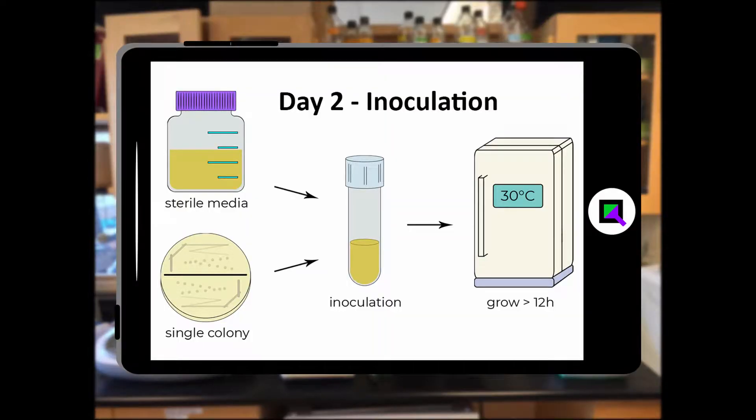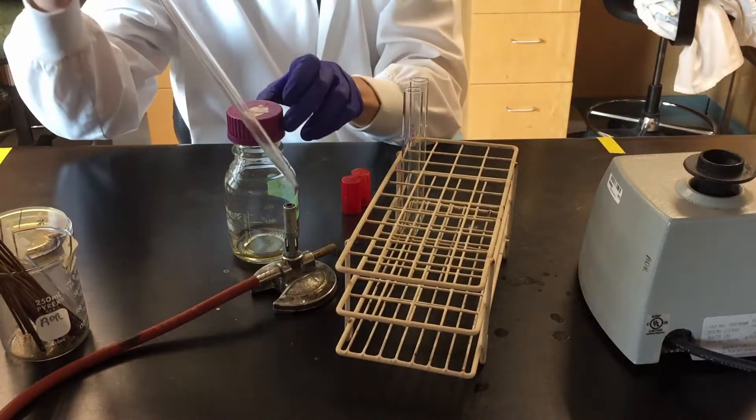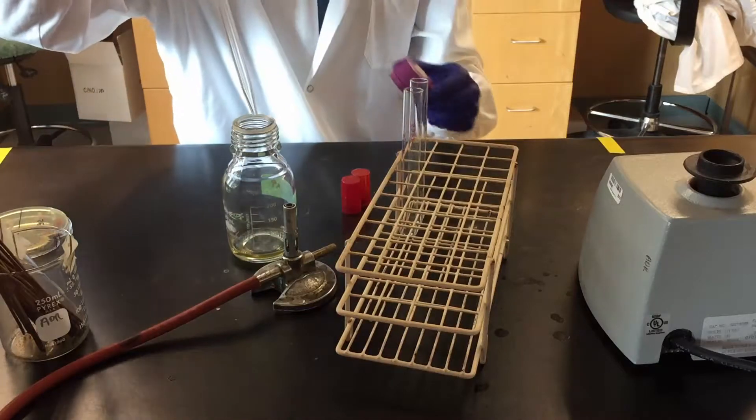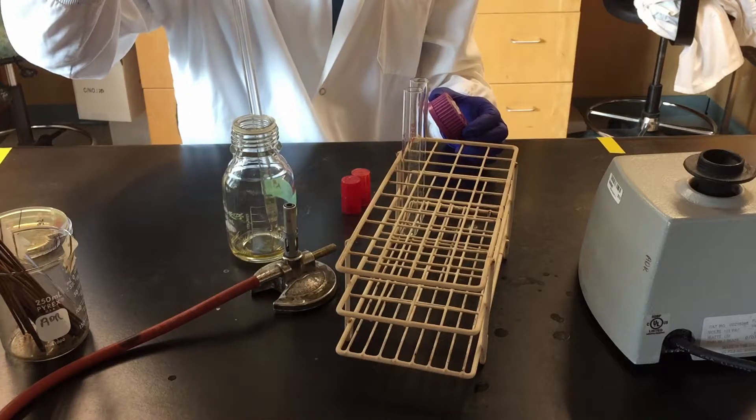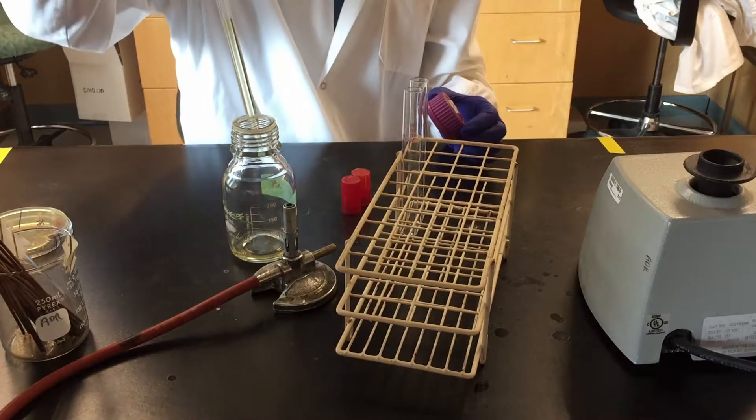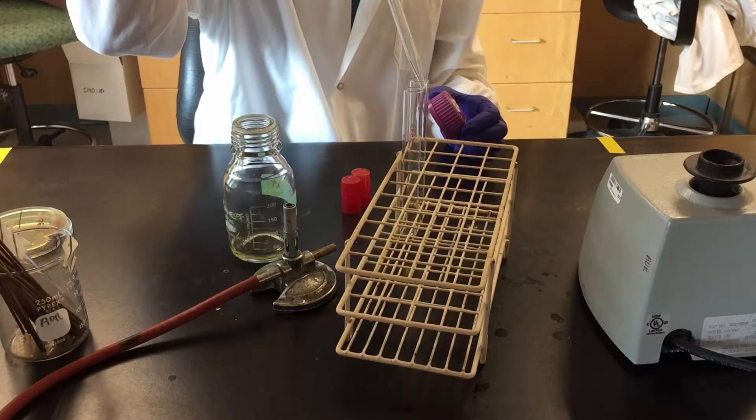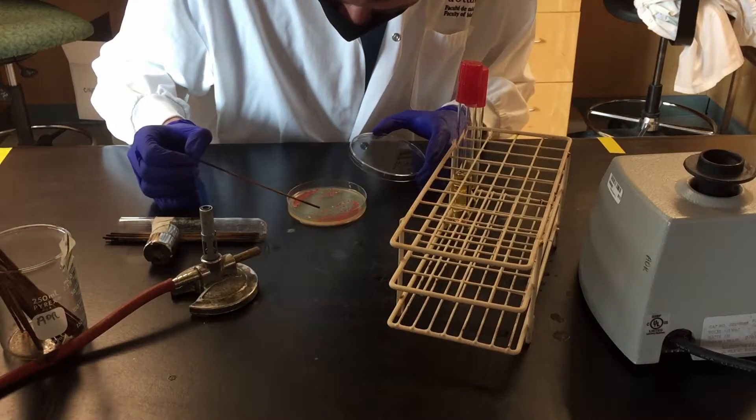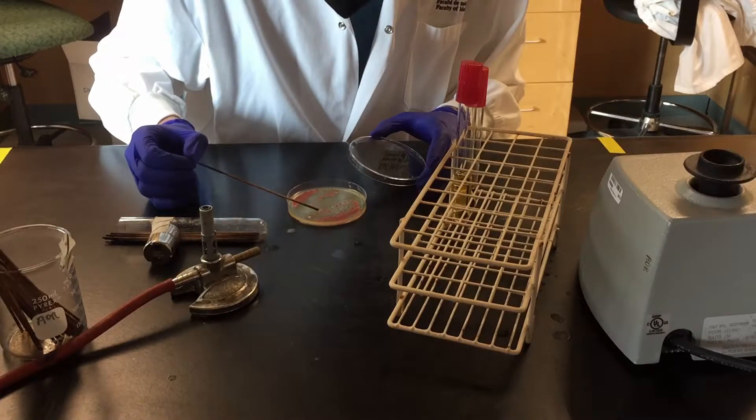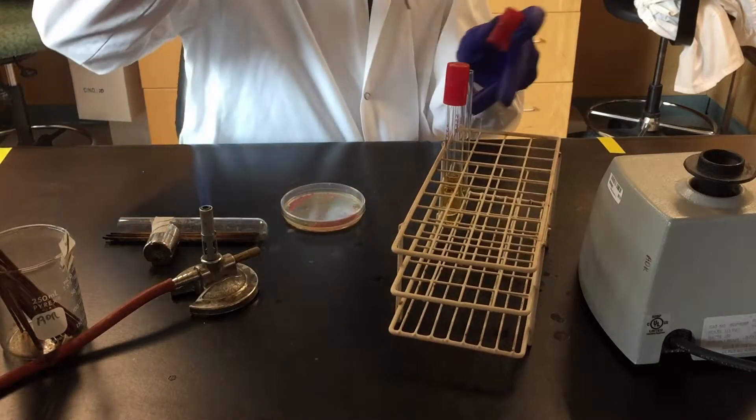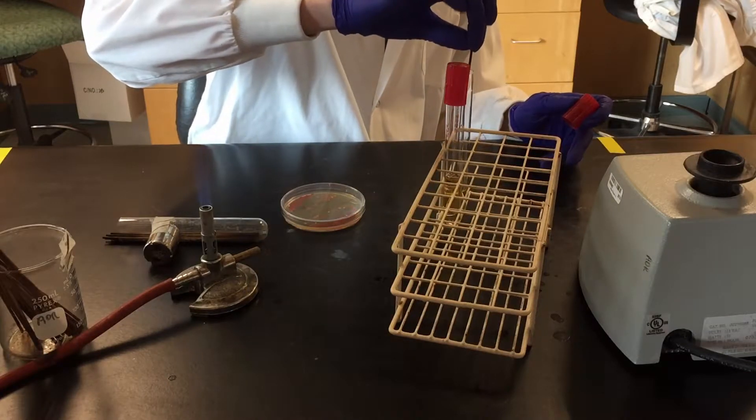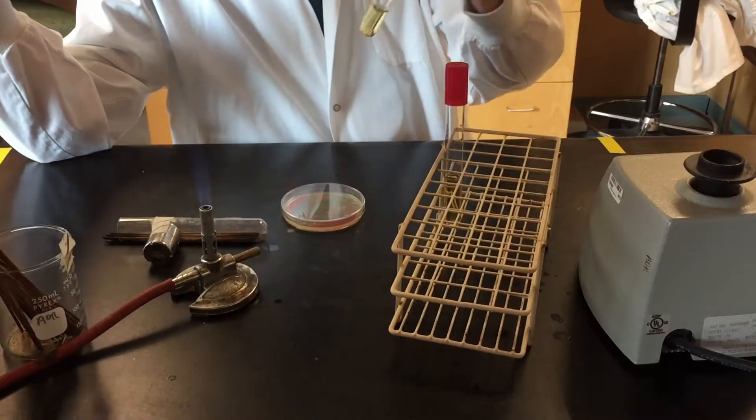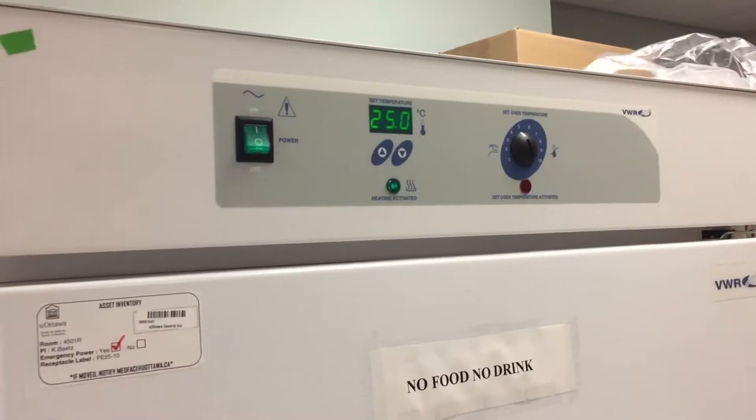Day two, inoculation. Fill a flask with sterile media. Inoculate a small amount of cells to start a liquid culture. Prepare some dilutions if you want to avoid over-inoculation. Incubate the cells overnight at 25 to 30 degrees.